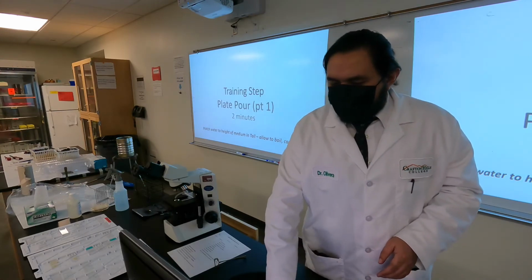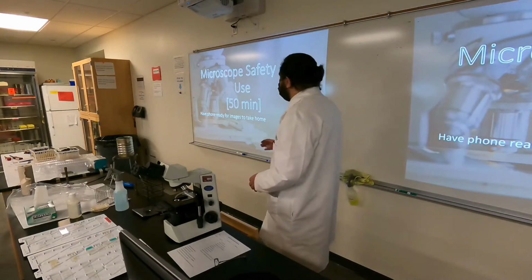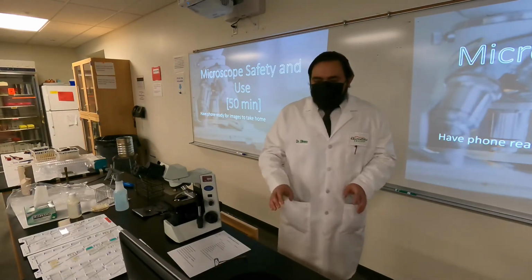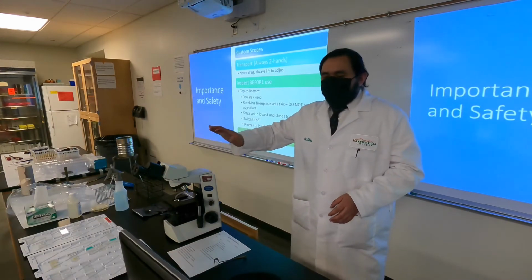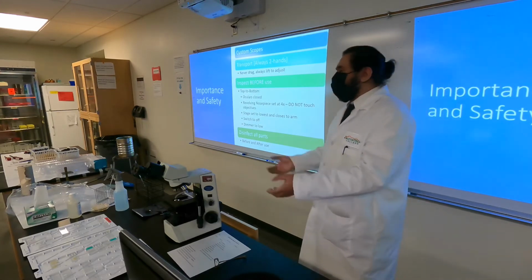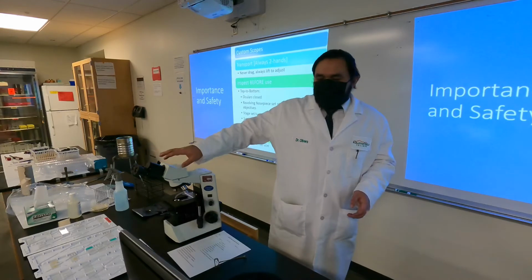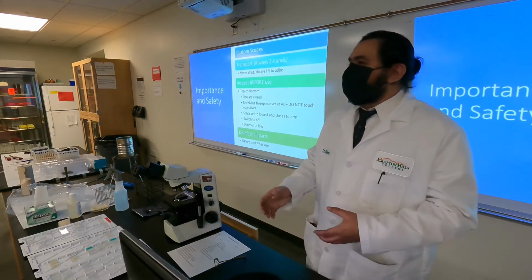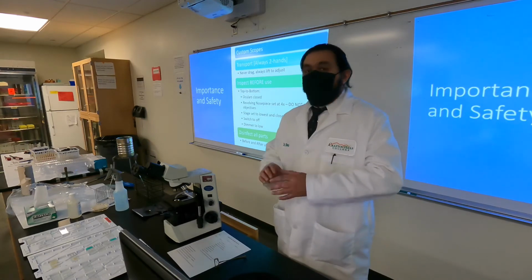So that's the plan. Now, for the rest of the time we have, we're going to actually use the scope, and the idea is we're going to show you what it consists of, how to transport it, do a quick inspection, and disinfect it to make sure that it maintains clean. We're going to clean the lenses after that, and then train you through all 3 steps of the use. And then after that, we go in reverse, and we're done.